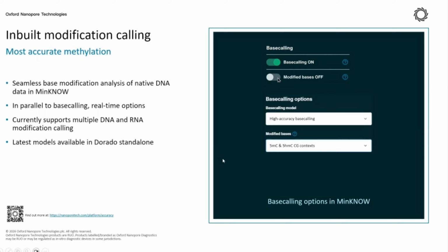run. If we forgot to turn on these particular options during the sequencing run, we are still able to reproduce the modified base information from our data once the pod5 files are available. So not to worry if, let's say, this is not turned on. As long as you keep the pod5 or the raw signal files from the sequencing run, we are able to redo this process and measure the epigenomics once the data is available.